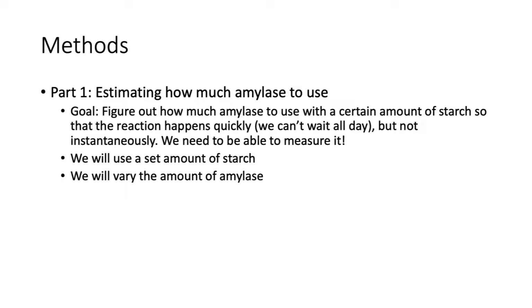Okay, so for this lab, the lab comes in basically three parts. The first part, we're going to estimate how much amylase to use. The amylase again is the enzyme, and we're going to be operating it on starch. So how much amylase can we use to get a pretty quick reaction? We can't wait all day for this reaction to happen, but we don't want the reaction to happen instantaneously because it's really hard to measure.